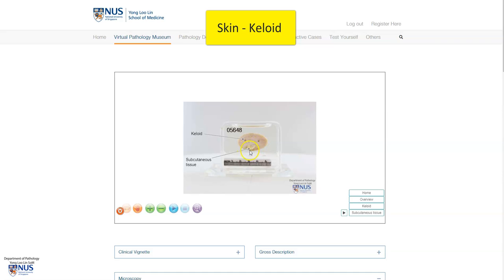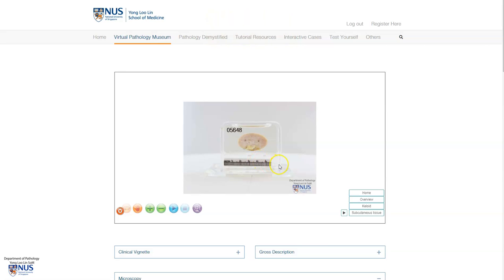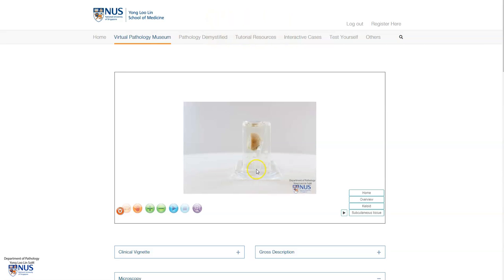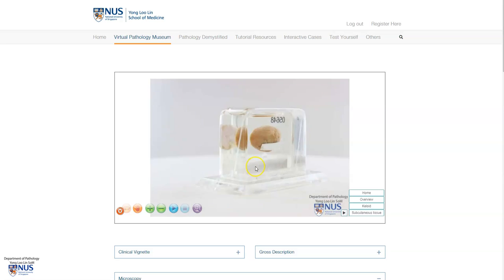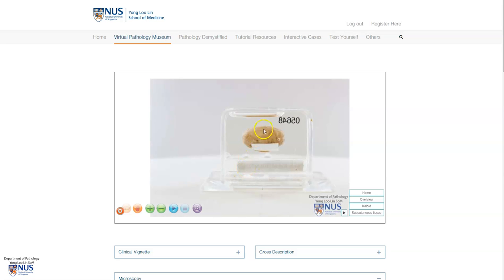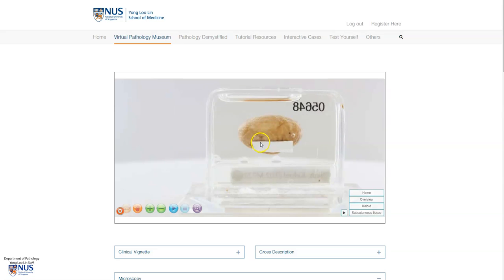At the deep edge, we have this yellowish subcutaneous tissue. Let me rotate this — and this is the side view. Here we can see on the opposite surface that the covering skin is shown.